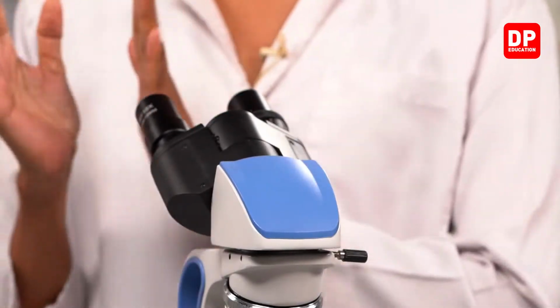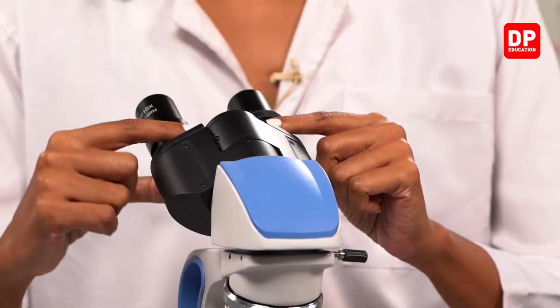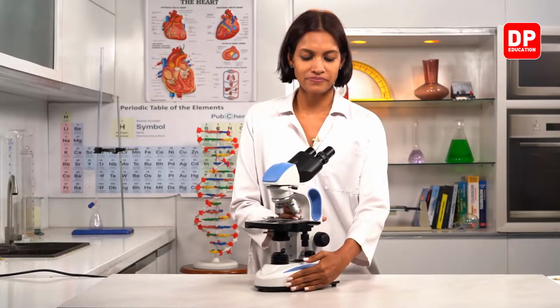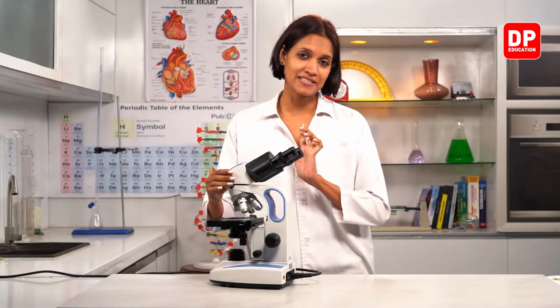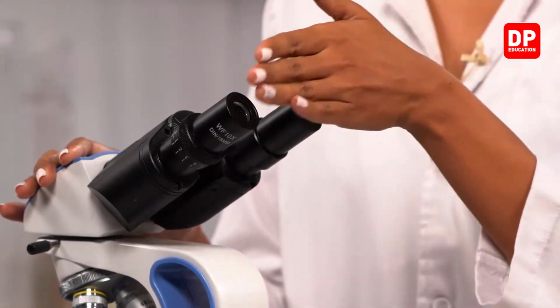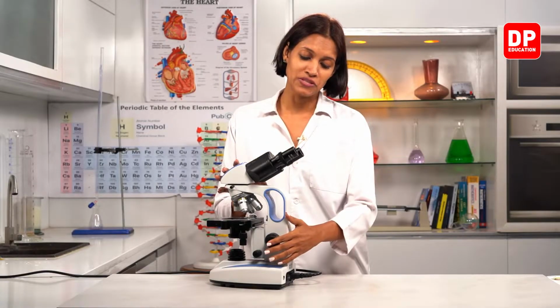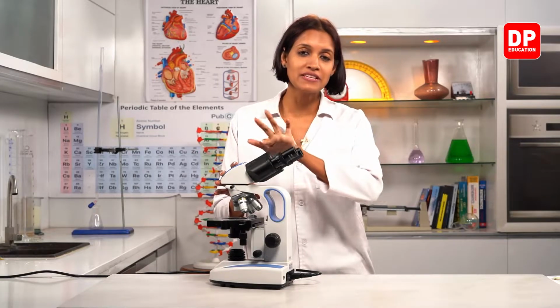Now normally in a basic compound light microscope, only one tube-like structure is there, right? You all can see here. Here there are two parts to keep both the eyes. So this is a modern microscope. Using both the eyes, we can get a clear image with a 3D effect. That's the importance of using these two. But most of our schools have the microscope with only one of these types of tubes.